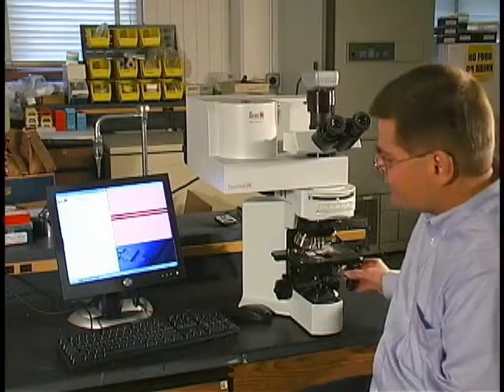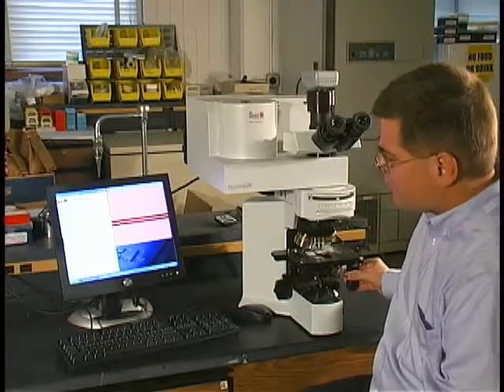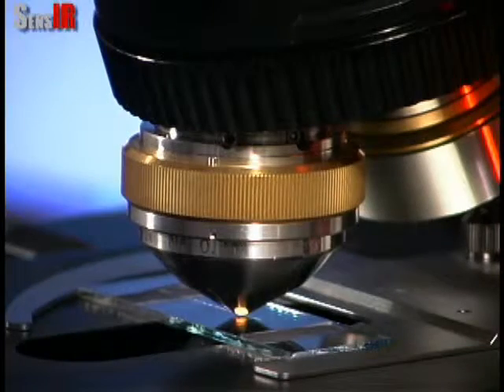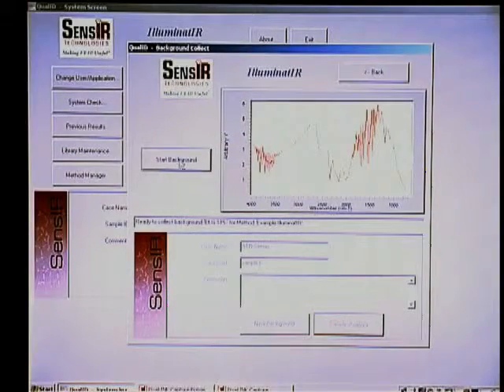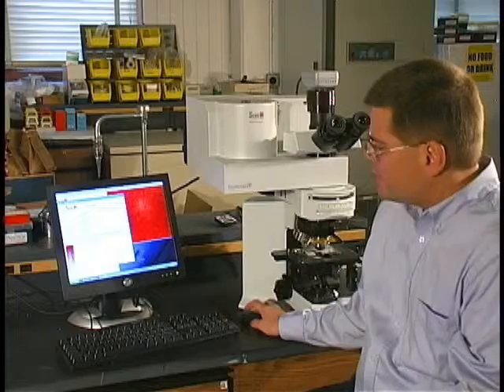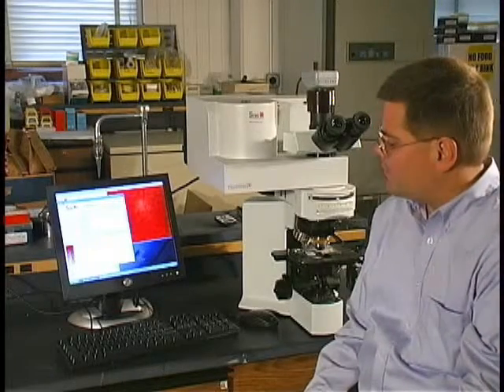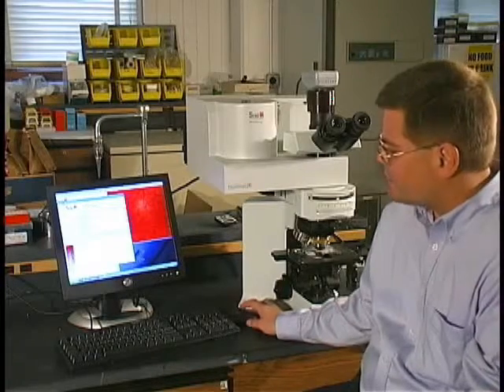Now I'd like to show you how the Diamond ATR objective is used to analyze a fiber sample. On the stage of the microscope, we place the fiber and position it in the center of the field of view. Next, you rotate the Diamond ATR into position and collect your background. In this position, the sample is two millimeters away from the business end of the Diamond ATR objective.